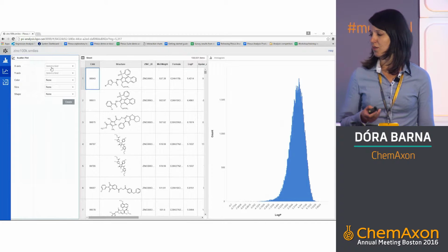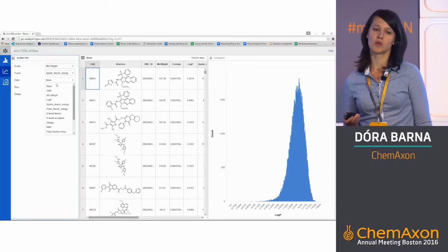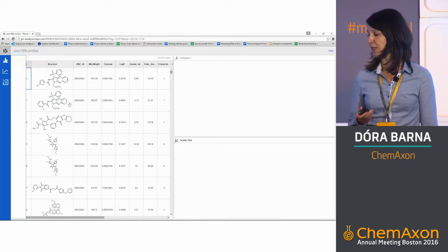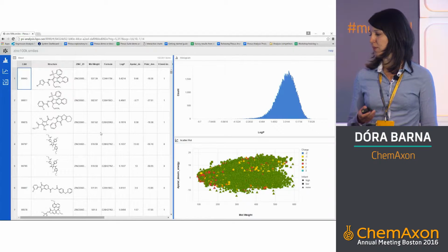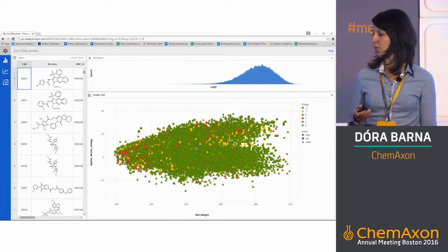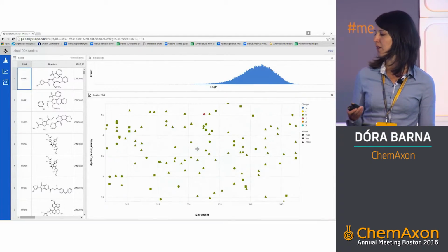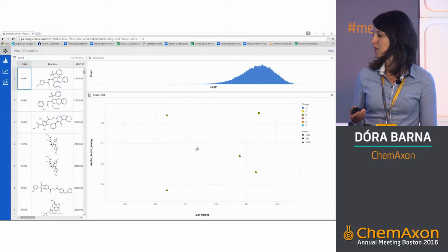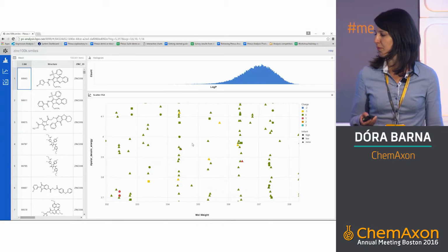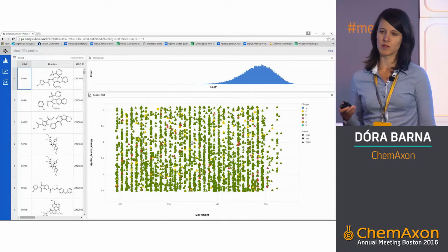And after that, we can create scatter plots as well in order to see whether we have some interesting relationship between our data set. Beside those basic XY charts, analysis can create more complex visualizations because the color, size, and shape of the scatter plot can be used as additional dimensions, so to say. And as we've just seen, we get the big picture with our scatter plot behind these 100,000 data points.